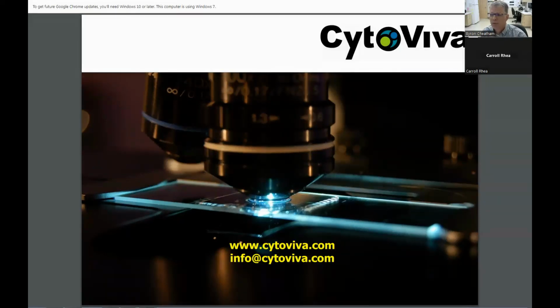Now, in the examples that we showed, there wasn't much signal at 400. The light guide that we were using had a cut-on at 420 nanometers. We could have used a light guide that started below 400 if we wanted to. This light guide that cuts on at 420 goes all the way out past 1,000 nanometers. And so generally with these kinds of samples, we're looking at more data out past, say, 800 nanometers. And the light guide that cuts on below 400 gets very weak out past about 700 or 800 nanometers. So that's why we didn't see much signal there.